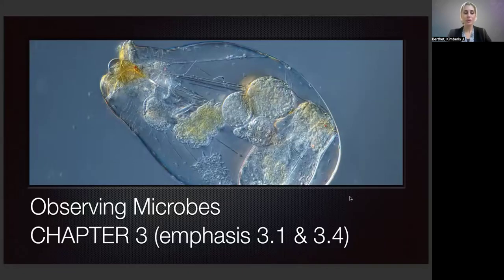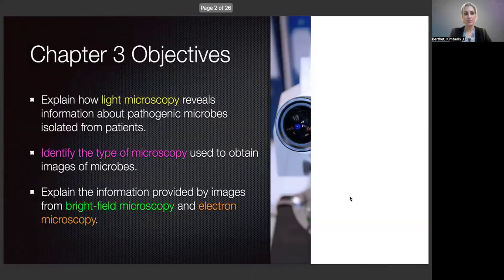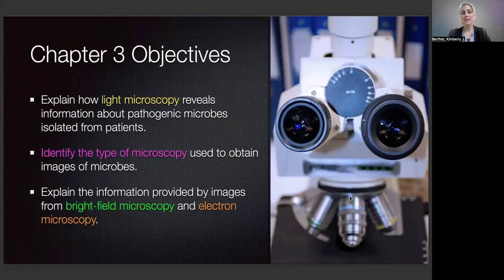Okay, today we're going to be looking at observing microbes. So this lecture is going to be based off microscopy. Looking at light microscopy, we have a couple different modes that we'll be getting into throughout this lecture. And beyond light microscopy, we'll even be getting into electron microscopy. So we're going to be comparing and contrasting the different types of microscopy used in microbiology.